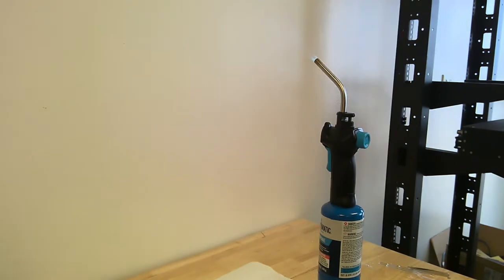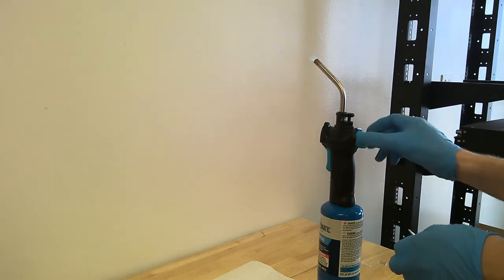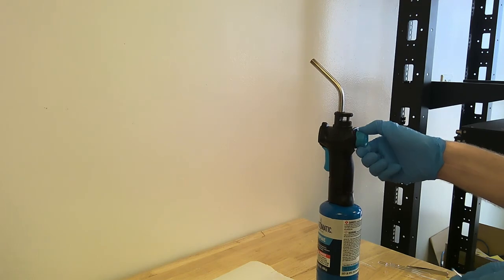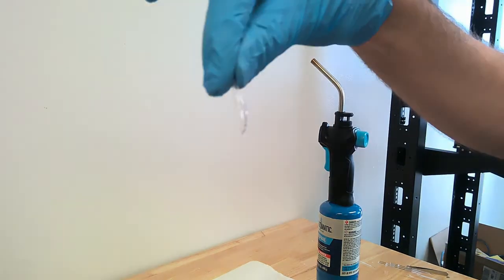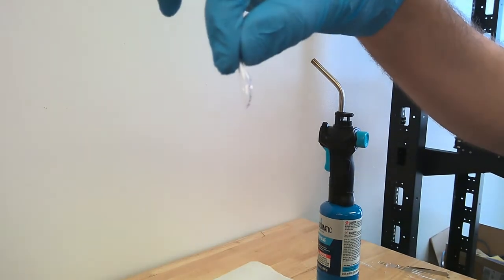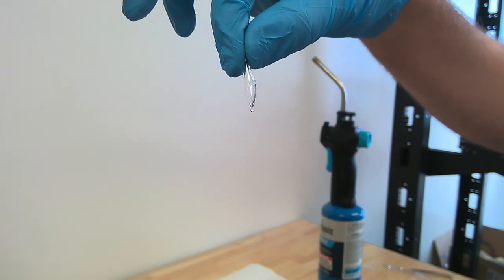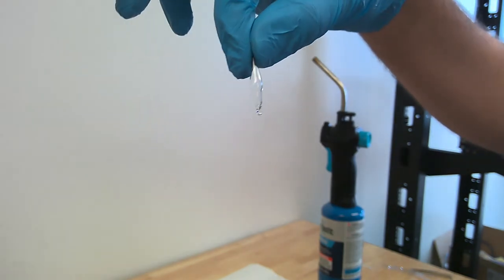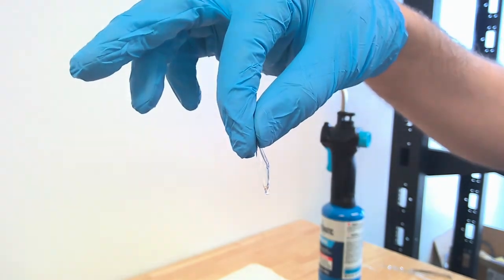So, just as a summary, to cap out our project today, we've prepared a series of micro-scale pieces of organic glassware. I'm going to turn off the flame. We have prepared, first and foremost, a micro-picnometer, which is designed to measure the density of micro-scale volumes of liquids. This is a large micro-picnometer that I prepared so it's easy for students to see. In the laboratory, you can prepare micro-picnometers that can even hold up to 20 microliters.